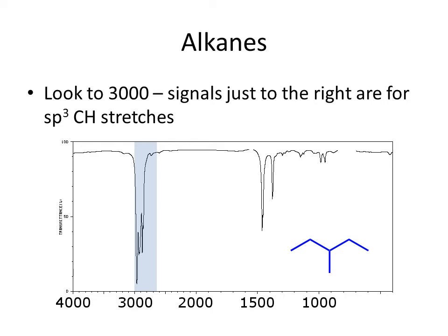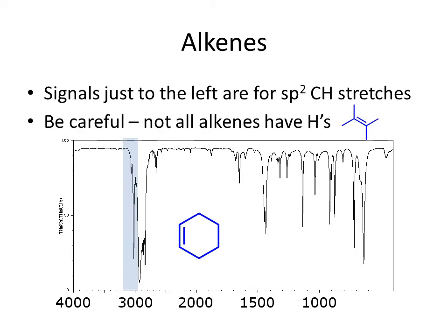So the first thing that we see is that CH stretches can be observed in the IR. And specifically, we're looking at sp3, that is alkane CH stretches. We can also see alkene CH stretches, but it turns out they're at a slightly different energy. An sp2 hybridized carbon bound to hydrogen has a little bit different force constant than an sp3 hybridized carbon bound to hydrogen, which is certainly understandable because the bond is made up of different orbitals.